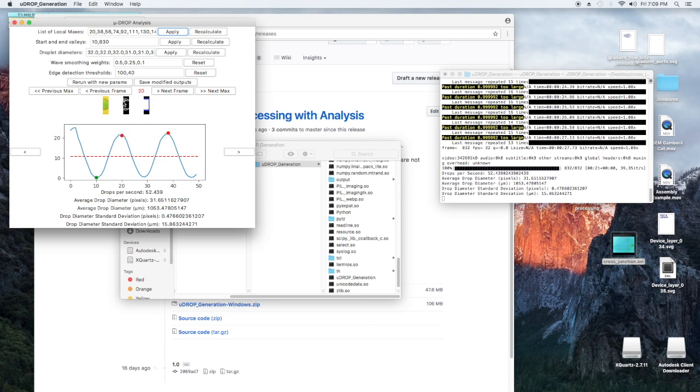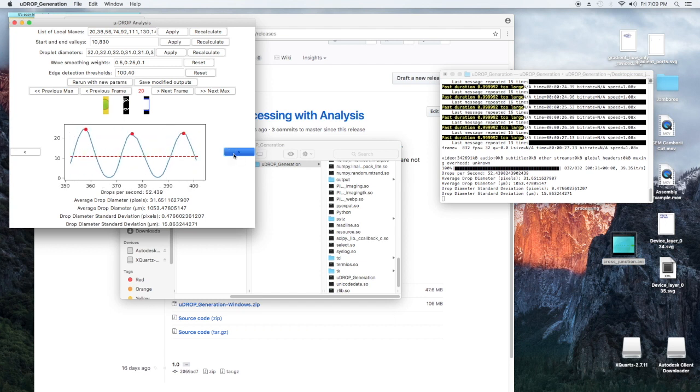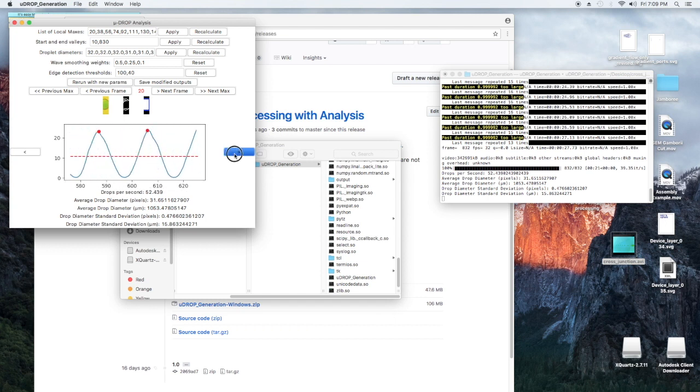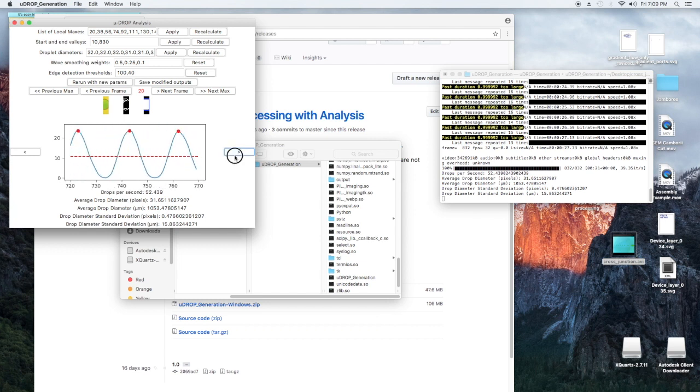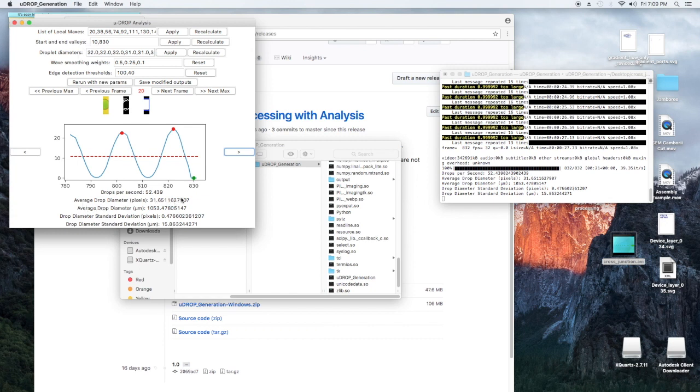So the droplet generation rate is calculated by the number of local maxes divided by the range of our start and end values. So this is a start valley, this is where we start measuring our data, and the end values are on the other side of this frame, or on the other side of this sine wave, I mean. And that tells us where to stop collecting our data. So that's our number of local maxes divided by the range of our start and end values. So that's how we get our droplet generation rate, so that's drops per second.